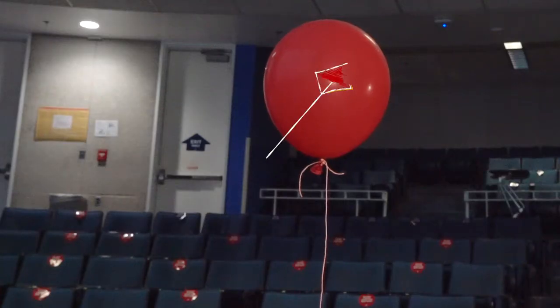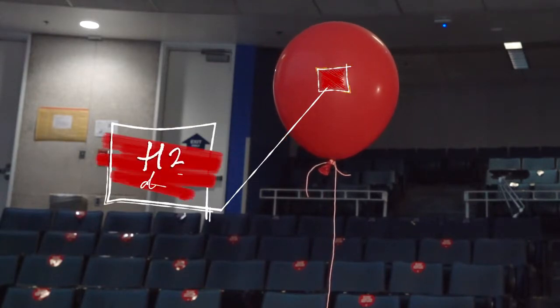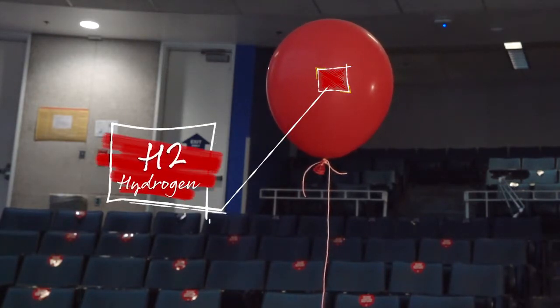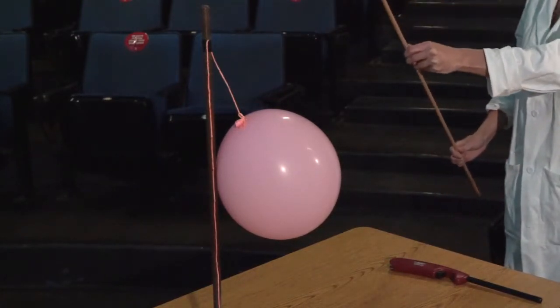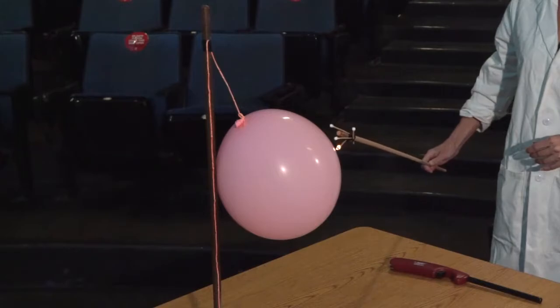All right, so let's take a look at our next balloon. For the third balloon, we have hydrogen, that lovely diatomic. Now remember that the first diatomic that we looked at, the nitrogen gas, did nothing. And so maybe this one won't do anything either. Maybe diatomic gases are inert. Let's find out.